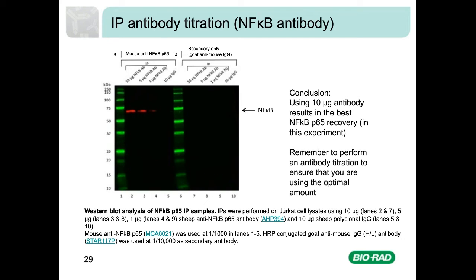My recommendation is that you always perform a titration of your IP antibody, as this parameter can really affect the efficiency of your IP experiment.